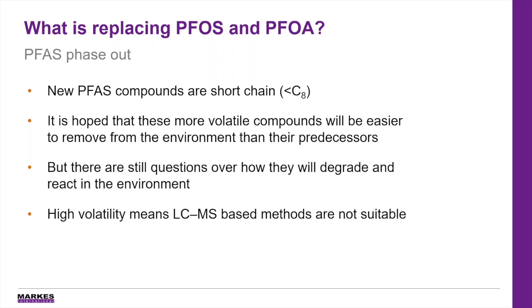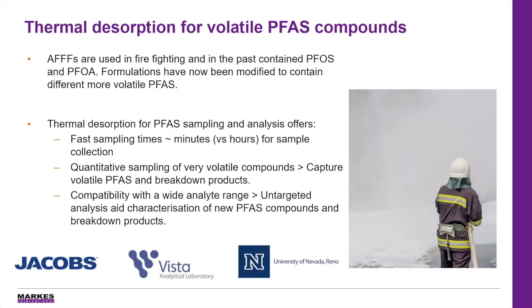Now, the difference in volatility, though, does pose an issue for the traditional PFAS measurement techniques, which focus around LCMS. So GCMS is now being assessed for these compounds, and especially when we're looking at them in air.